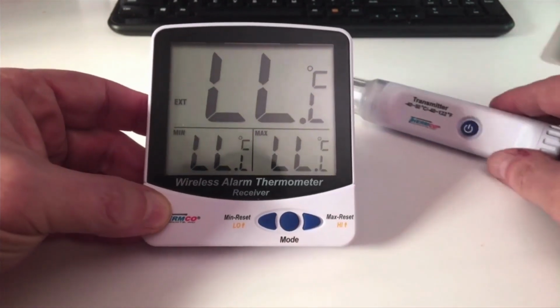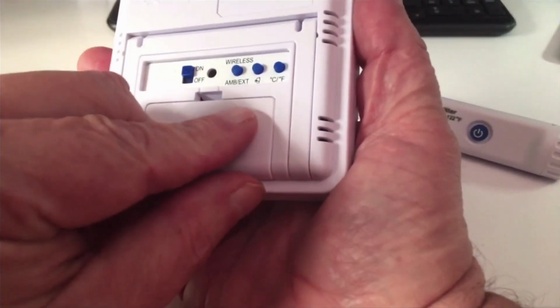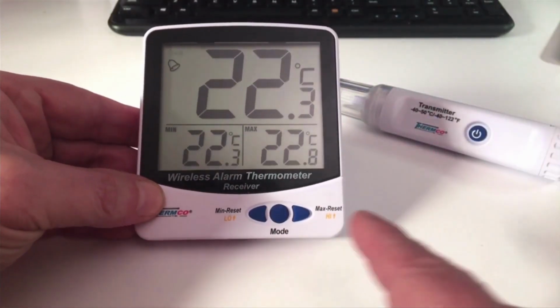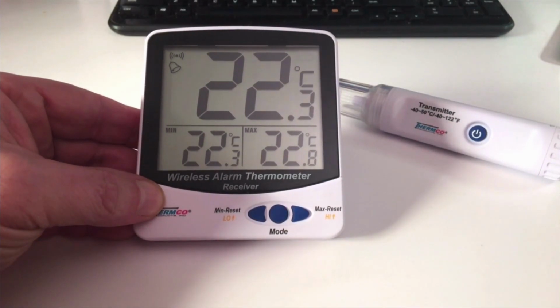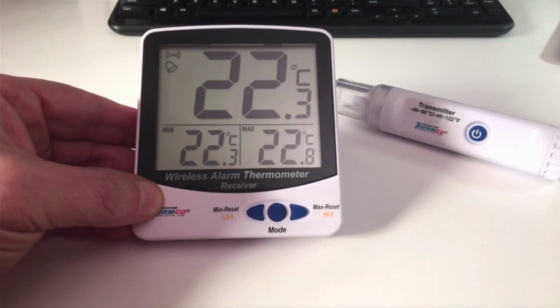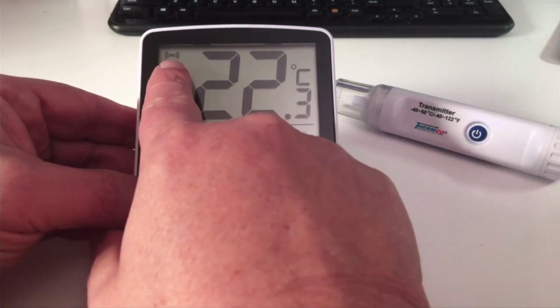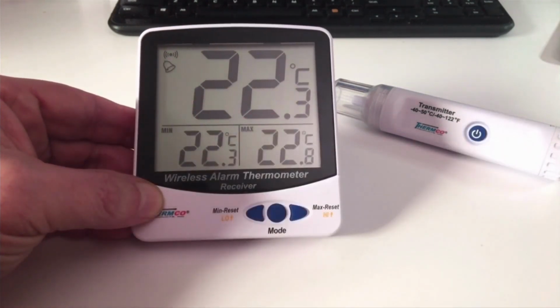But we want to measure temperatures with our wireless sensor. So again, turn over the unit and depress, once again, the wireless A and B EXT button. You now see CON on the display, and then the actual temperature from the wireless sensor. The wireless sensor updates the display every 30 seconds. You will also see the wireless symbol up in the upper left-hand corner, so you know you are getting a signal from that sensor.